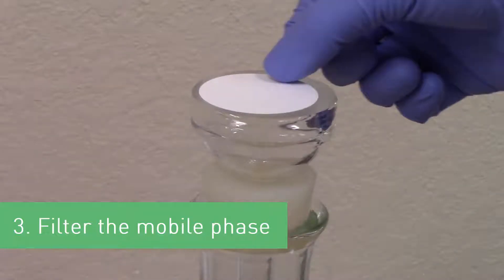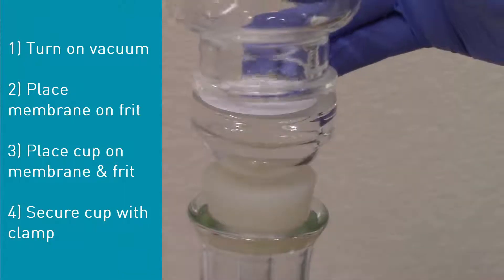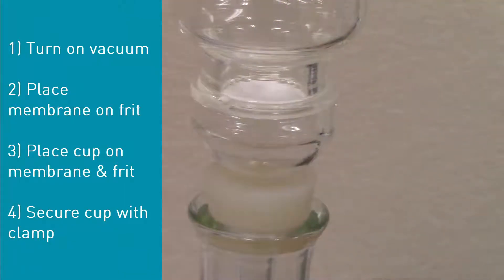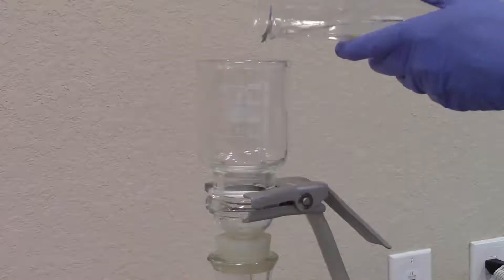Third, filter the mobile phase. Turn on the vacuum pump first to ensure that the filter membrane seals to the frit. Then place the cup on top and secure it with the clamp. Now you're ready to add the mobile phase solution to the filter cup.